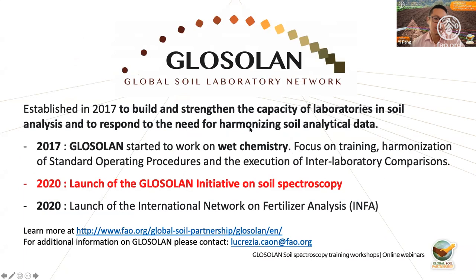such as the Global Soil Laboratory Network, GLOSOLAN. GLOSOLAN was established in 2017 to build and strengthen the capacity of laboratories in soil analysis and to respond to the need for harmonizing soil analytical data. GLOSOLAN started to work on wet chemistry analysis, focusing on training, harmonization of standard operating procedures and the execution of inter-laboratory comparison. Last year, we launched the GLOSOLAN initiative on soil spectroscopy, and also launched the International Network on Fertilizer Analysis. For more information on these two initiatives, you are very welcome to visit the GLOSOLAN website, or write an email to me or to my colleague, Lucrezia.